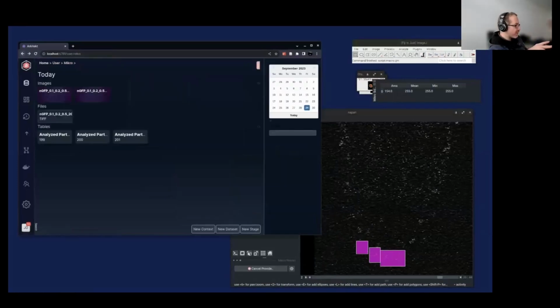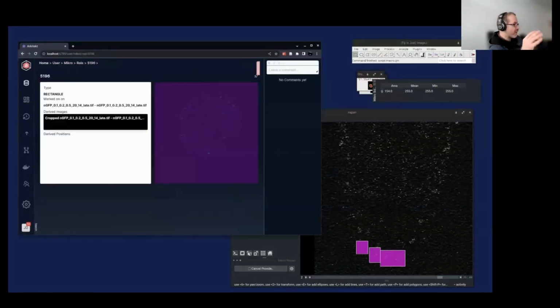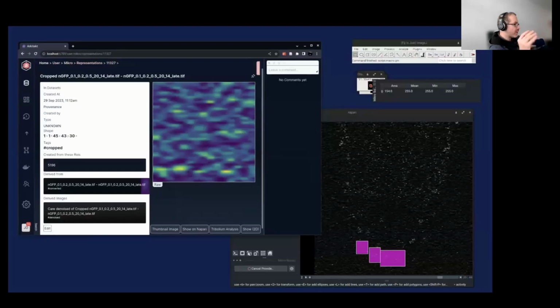I have a question about this step here. When I design a workflow, I create it step by step, but before having the whole workflow, I need to check if the settings are good or not. Could we make a stop in the execution of the whole workflow, saying, here, give me a stop, let me show the result, let me fine tune, restart, restart, restart, without cutting the workflow into many little parts? So you mean an interrupt, to inspect the results? Yes, like a wait for user in your big Fiji macro: you check, you manipulate, and when you're happy you continue or you cancel and restart.